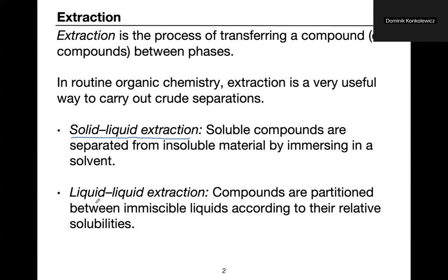Okay, liquid-liquid extraction, on the other hand, we have to pick two liquids which are not miscible, right? So going back to that old principle that oil and water do not mix, right?